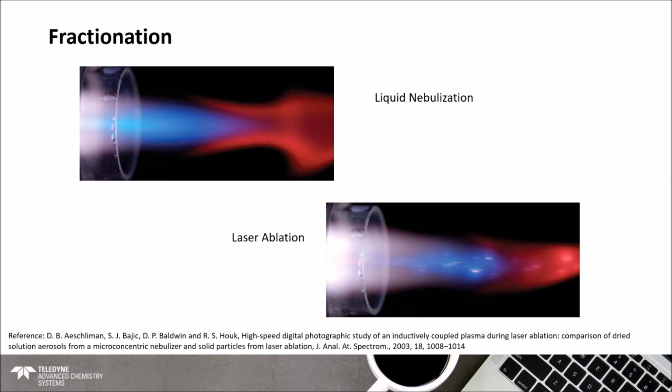You can have large particles that aren't ionized at all. So you can actually see them here entering the torch. You'll also notice that if you're looking at the corresponding MS data, the signal would appear much noisier than it would with aqueous analysis. But in this case, all of that, quote unquote noise is all very real data. It's just all coming from the individual particles as they're being ablated. So it's just a little bit of a different way of looking at it is all.